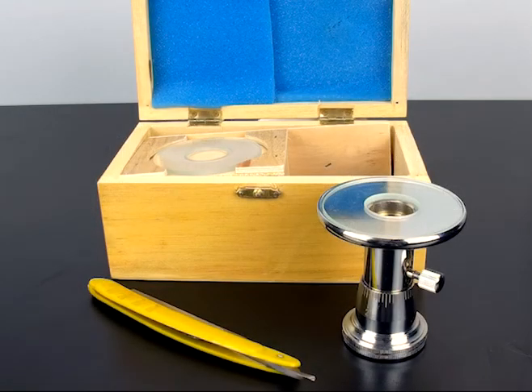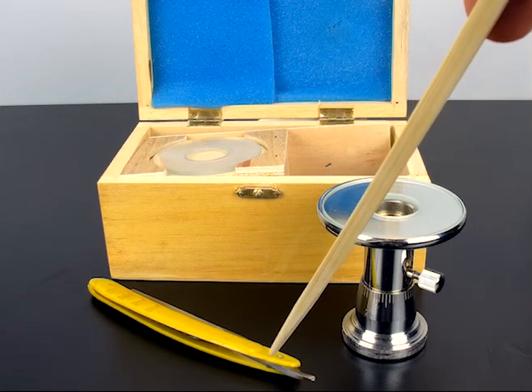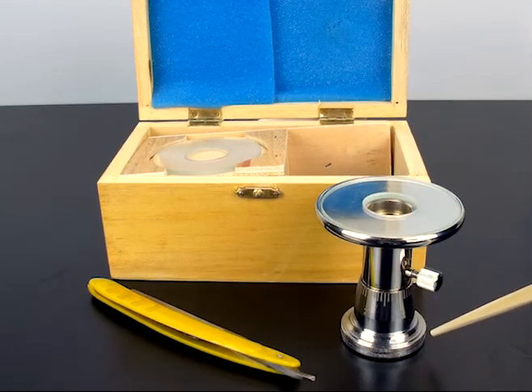The bare hand microtome is capable of slicing micro-thin sections as thin as 10 microns. The apparatus comes with two glass washers to act as your cutting surface, a straight edge razor, and the microtome itself.